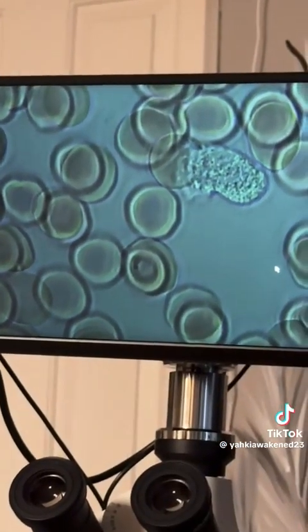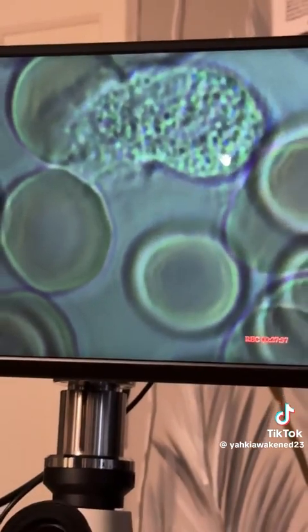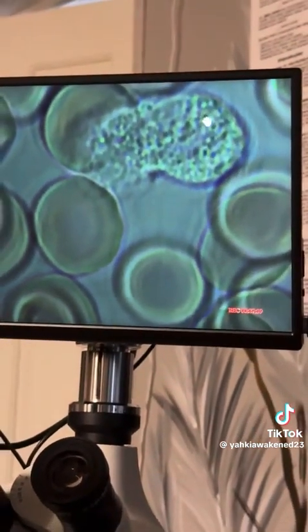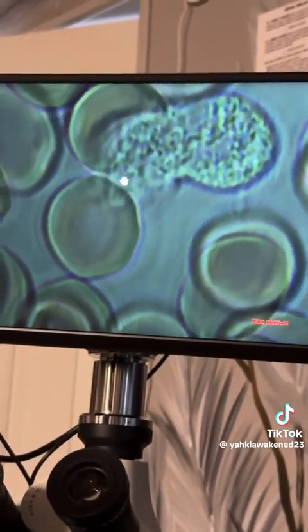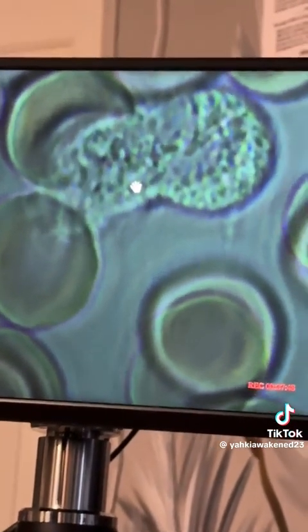This is a basophil. Now what you got to do is zoom in on this basophil to see if the phagocyte cells are in there phagocytosing, and you can tell if they're moving. So we see that we got movement, and then you see these little black spots in here, or things that they're eating. You see how they in here eating, y'all? Can you see that, Nabi? Mm-hmm. Can you see it on the camera? Mm-hmm.